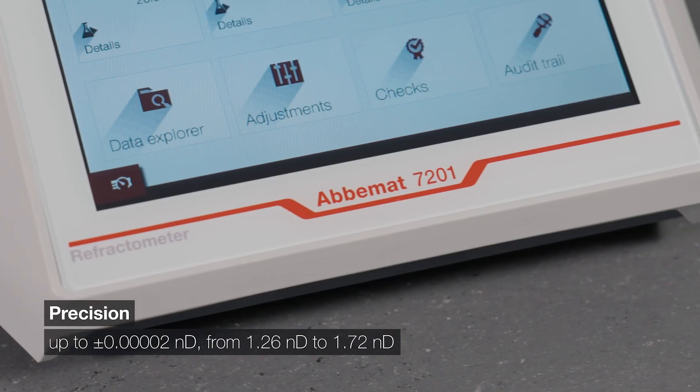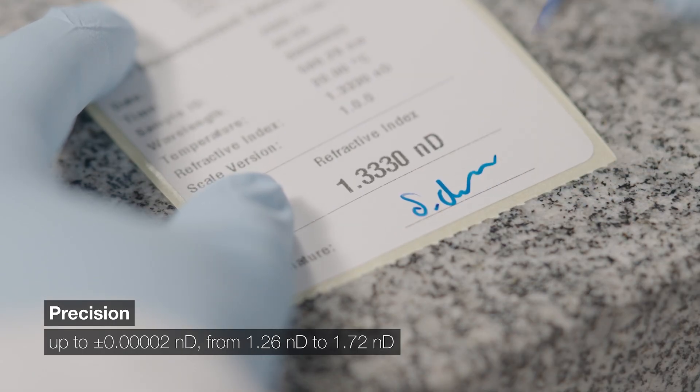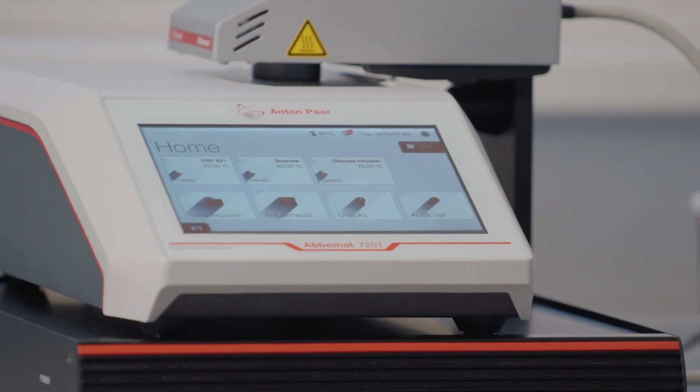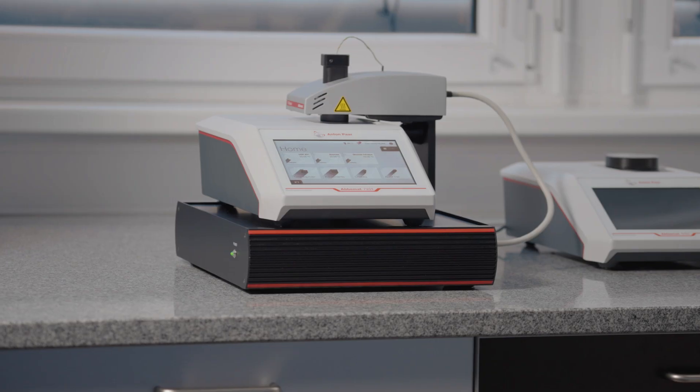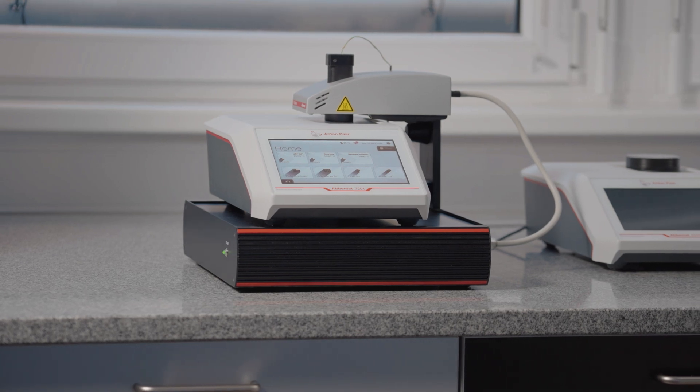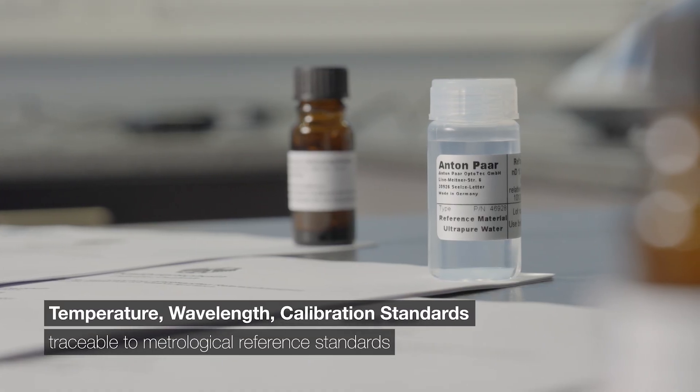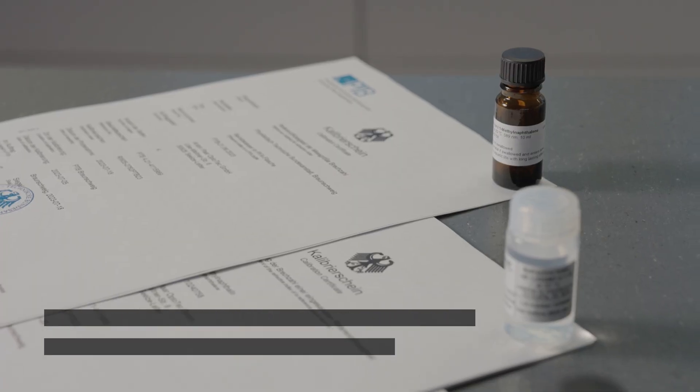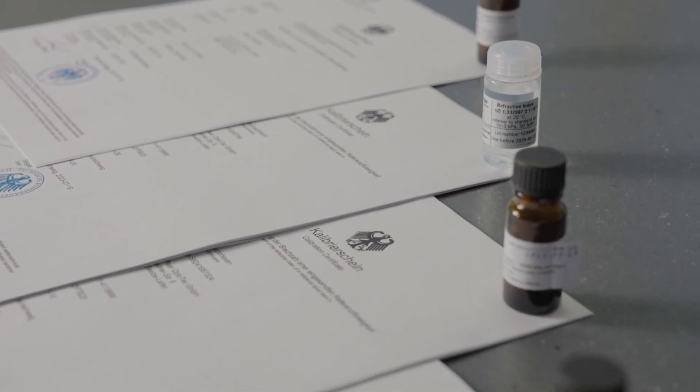We know you need precision you can rely on, day after day, without any compromises. That's why we check all our Abiumat Refractometers before they leave the factory for temperature accuracy with a patented Anton Parr T-Check. We also individually tune the wavelength of the light source and adjust each Abiumat with the world's most precise calibration substances from the renowned PTB.